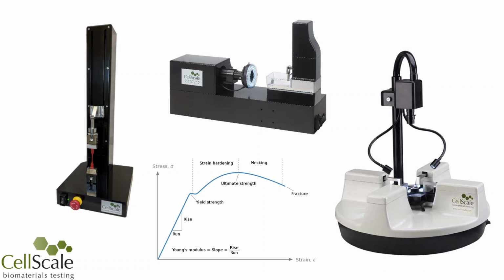Today I'd like to show you a software tool we've developed for analyzing the data from our materials testing systems. I'll be demonstrating the software on a UniVert system, but the software tools are similar for the MicroTester and BioTester series of products.